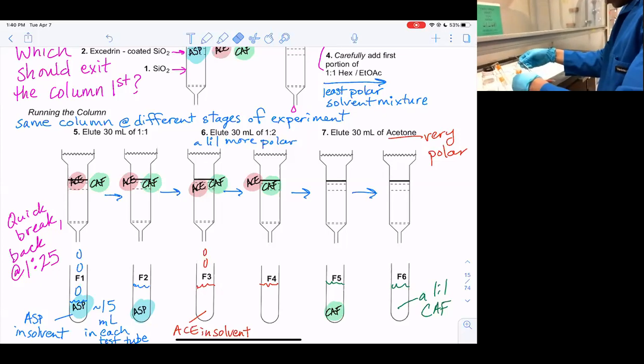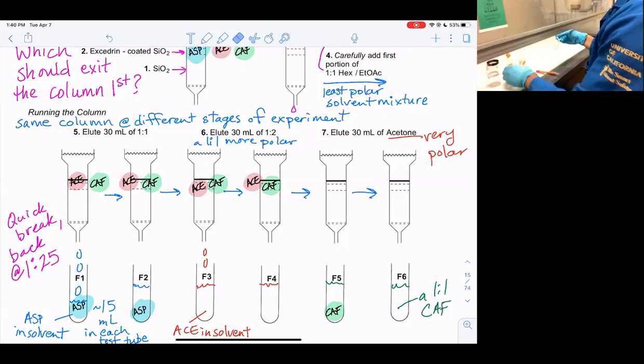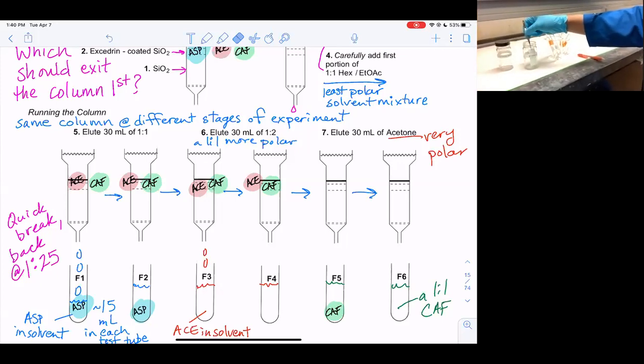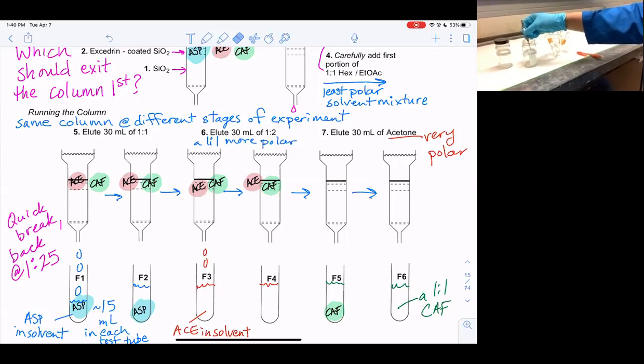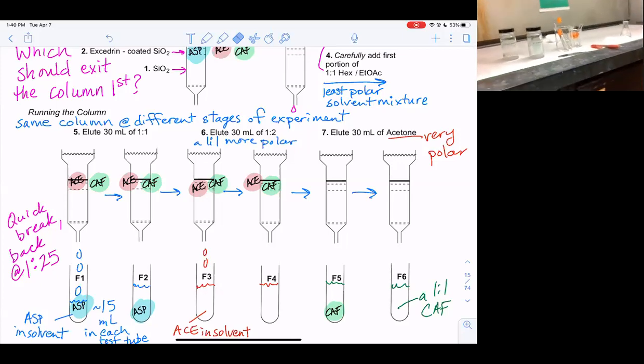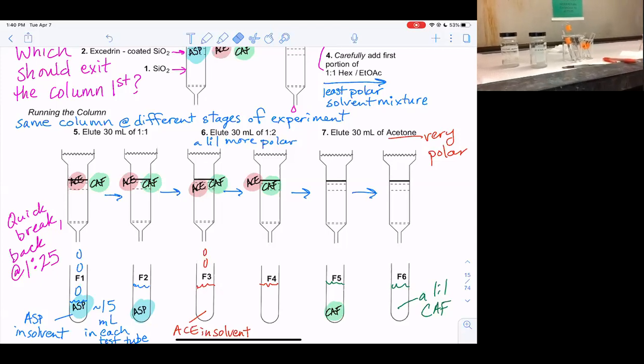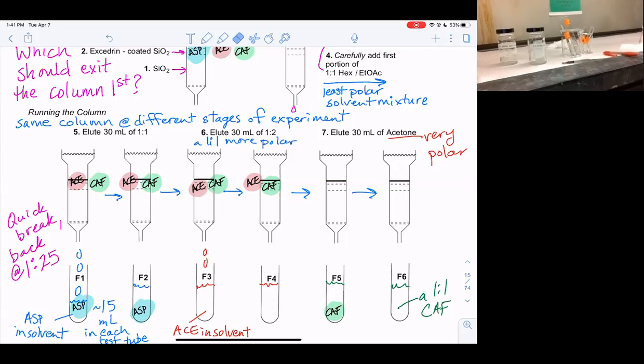And so then you take it and you have your chamber here. And then I always put mine in the front slowly. That wasn't a great try actually, but it might be okay. So it should be more uniform. There's a little curve there because some of the solution kind of got on the sides, smushed up a little bit, but it should equilibrate the higher up it goes. So if not, then I'll rerun it, but it should be okay.